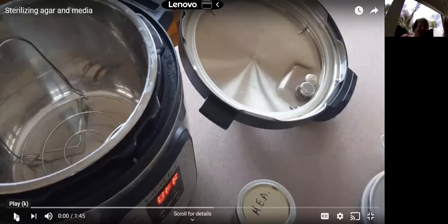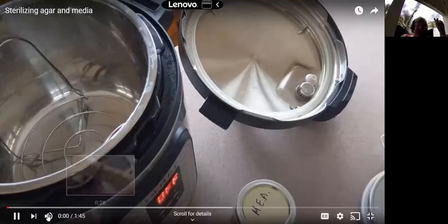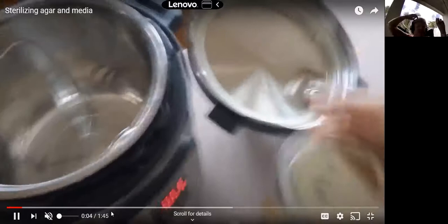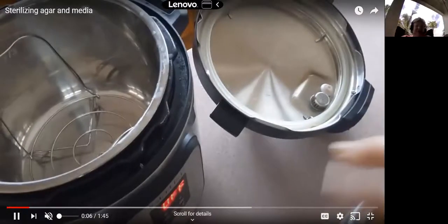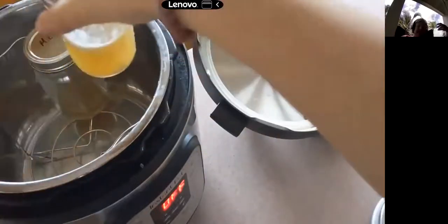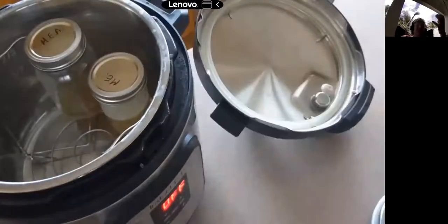The trick with sterilization: you put your media into your pressure cooker. You want to make sure that the caps are loose because you are going to expose these cans to pressure. And just like any other canning process, you want to allow the air to escape a little bit.